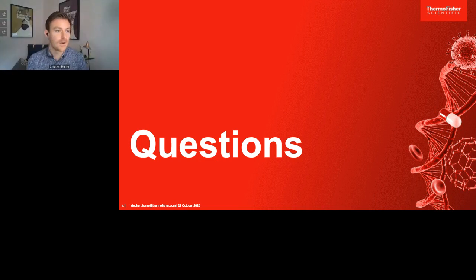Great, thanks, Mark. We're just over time, but I'll squeeze one more question in for yourself, Mark. Scott's asking, have you tested cell aggregate size distribution control by modulating the agitator speed?